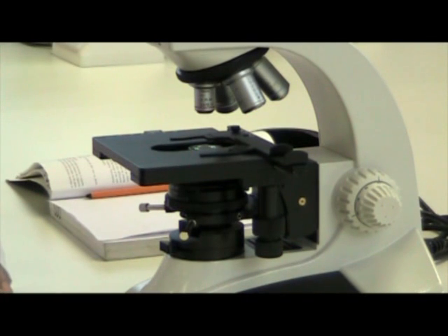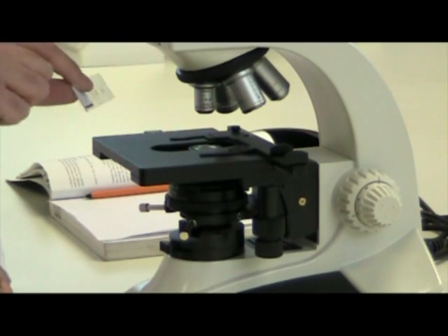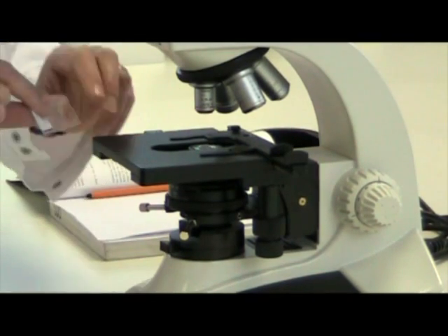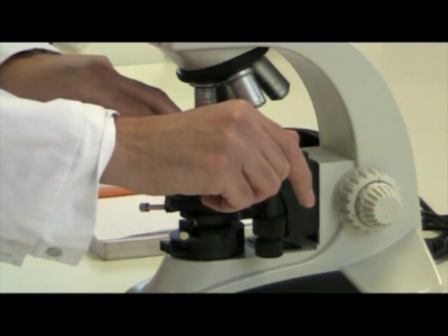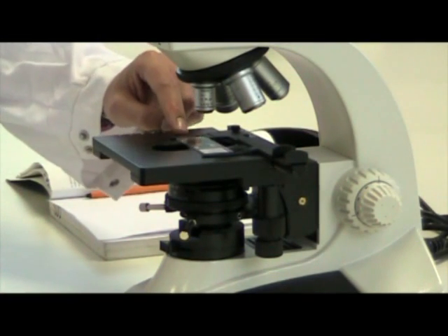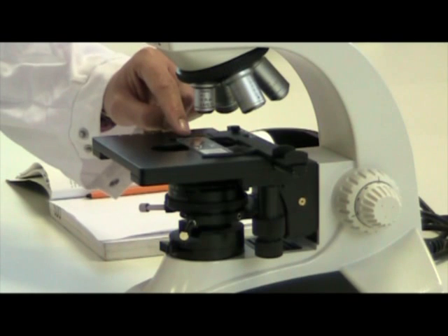Then we need to put the specimen on the microscope slide onto the stage of the microscope. This is the stage. So carefully sit the specimen on the stage, making sure that the microscope slide is the correct way up.